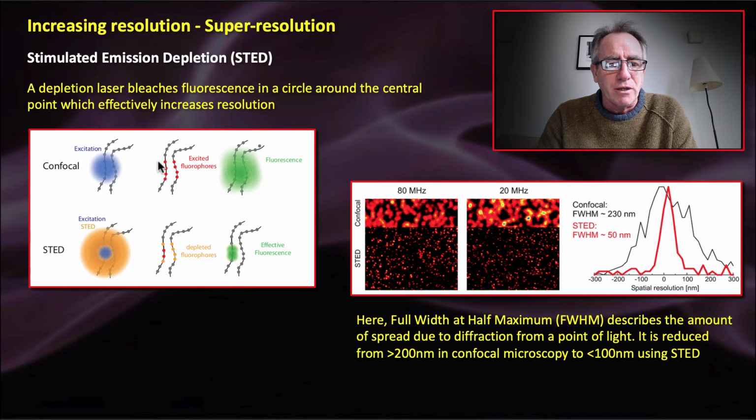That tends to excite the GFP, whatever it is. It could be RFP, it's colored red there. It excites it in a region around where the laser was targeted, and you get this fluorescence that's sort of generalized to an area. It's lighting up all of the fluorochromes in that area there. STED goes one step further.